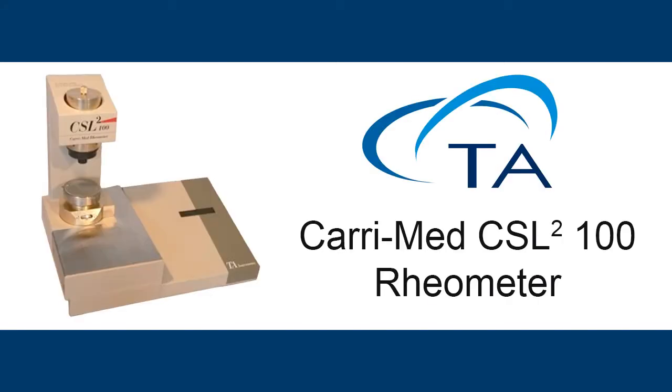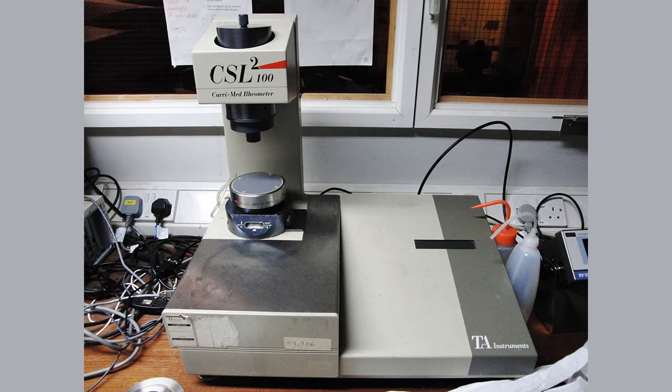This video will discuss the use of the TA Instruments CSL2 Rheometer. The key parts of the instrument are the LED screen, the air bearing, and the sample plate.